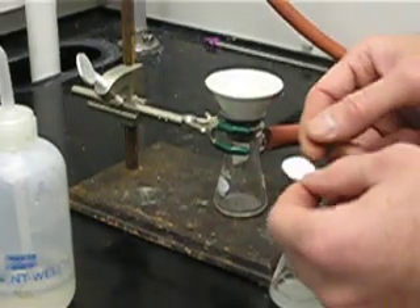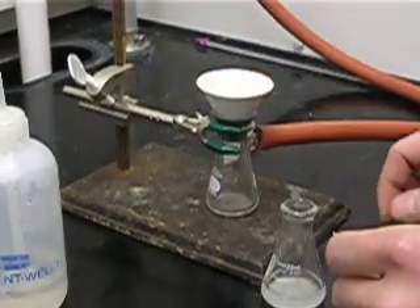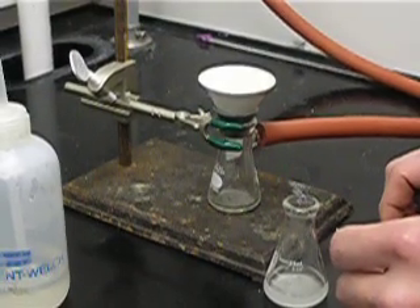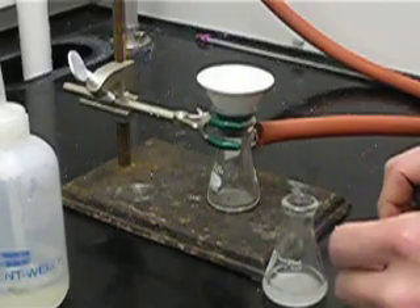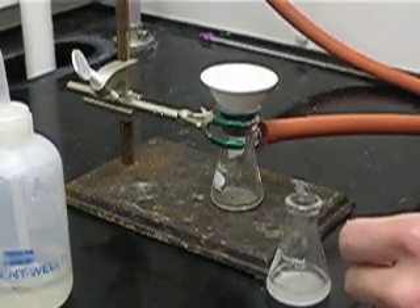Before putting the paper onto the Hirsch funnel, we want to turn the valve controlling the aspirator completely on — not halfway on, but turn on the water completely.